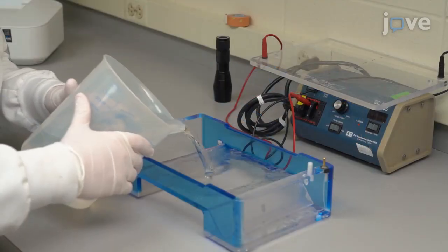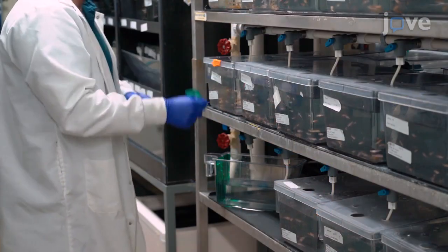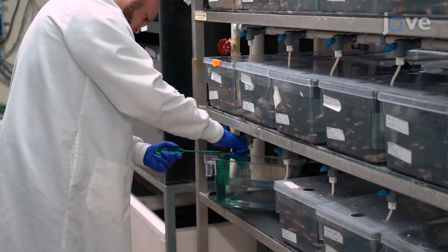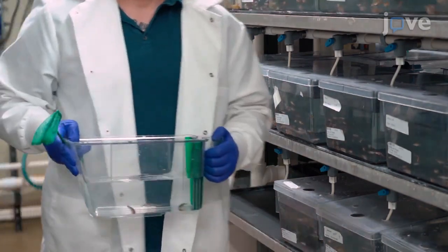After adding 800 ml of system water to the Shuttlebox, place 2-3 fish into a holding tank containing system water. Leave the tank in the dark room where the Shuttlebox assay will be performed.